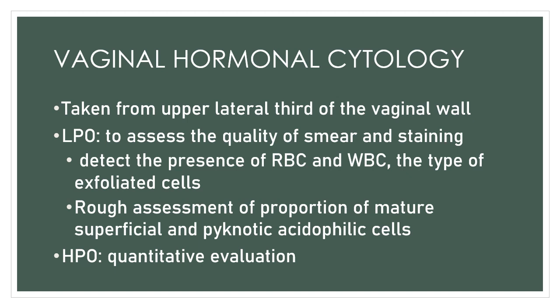And then you have your rough assessment of the proportion of mature superficial and pyknotic acidophilic cells. That is for your LPO. But in your HPO, that is for the quantitative evaluation. Again, accordingly, vaginal hormonal cytology is not used nowadays.